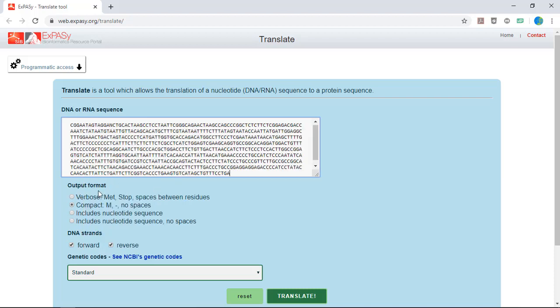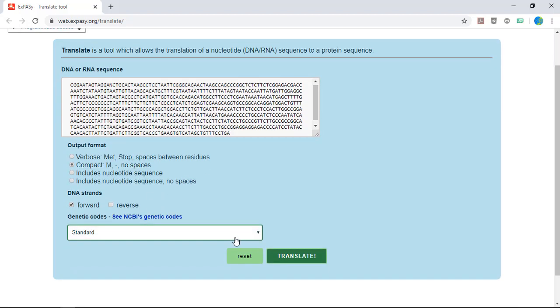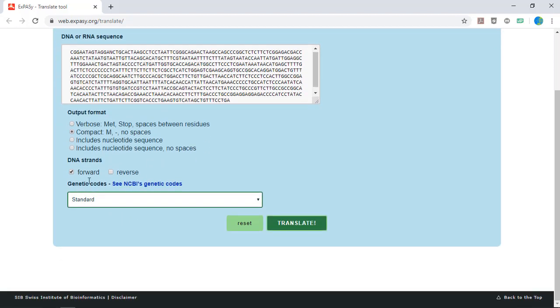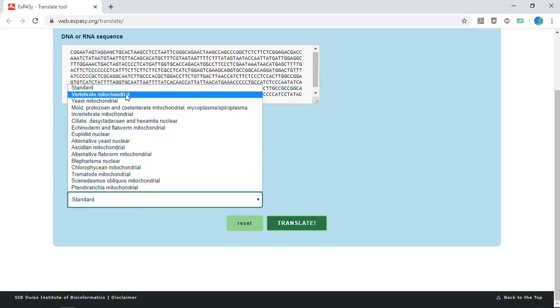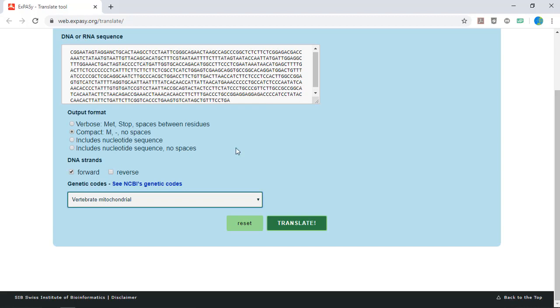Leave the default selection of compact view and select only the forward DNA strands by checking the box. Make sure that under genetic code you choose vertebrate mitochondrial because remember this is a mitochondrial gene. Now click translate.